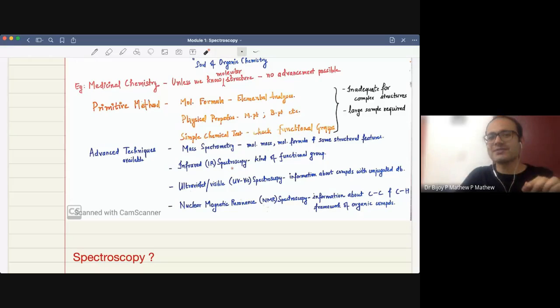If you have a sample, you can load that sample into your spectroscopic instrument. We have this infrared spectroscopy in our college. You might use it if you do some projects, but you do not have experimental projects this time. We used infrared spectroscopy to determine the spectrum of the compound. This powerful technique gives you an indication about the functional groups that are present in the molecule.